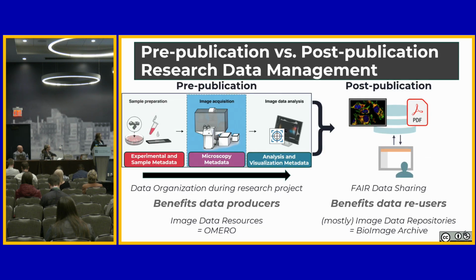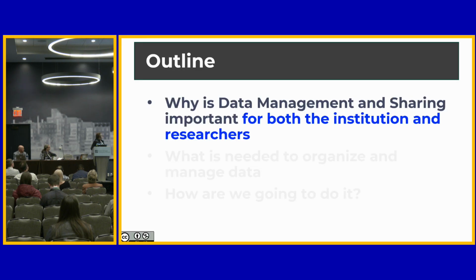So there is pre-publication and post-publication data management. One part is more about management and organization, the other part is more about sharing, but management and organization happen on both sides. Even during data production, we want to share with colleagues, lab members, ourselves, our future self, and so on. So overall, we could call it day-to-day management and then sharing, but these categories are not necessarily strict, it's just a way of starting to think about it.